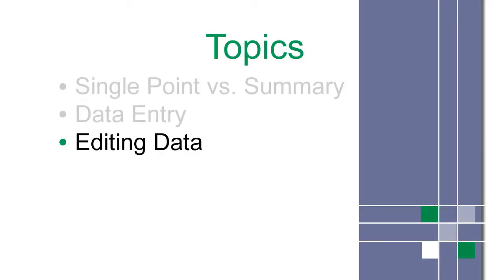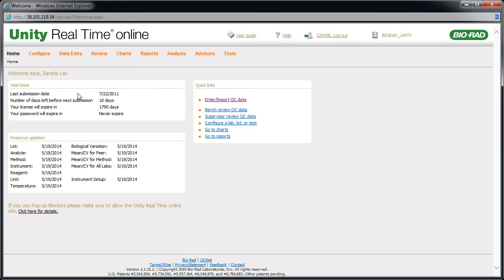Finally, let's look at editing data. If you've already submitted data, please contact Biorad after you've made an edit.